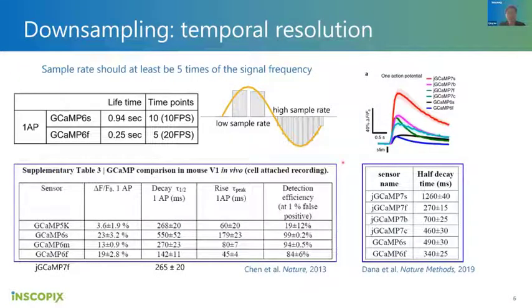So how much downsampling you can do temporally, there are some signaling considerations. That's about the raw signal frequency and how fast you want to sample and to detect events. It also depends on the GCaMP you're using. For example, GCaMP6F is a fast type, so each event will be faster. So we potentially capture the real dynamics, not action potentials, but certain events like complex spikes, which happen at a millisecond scale. And if you don't use the 6F, you will probably miss that.